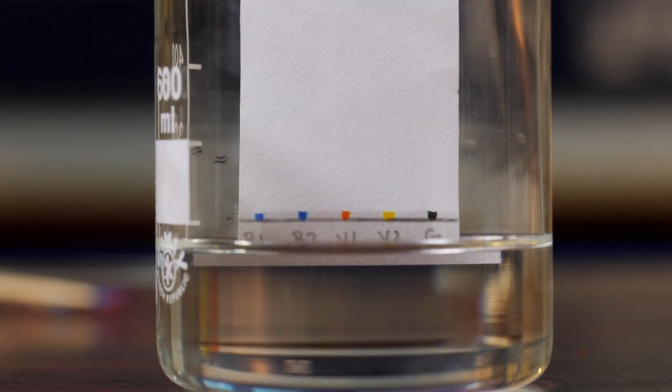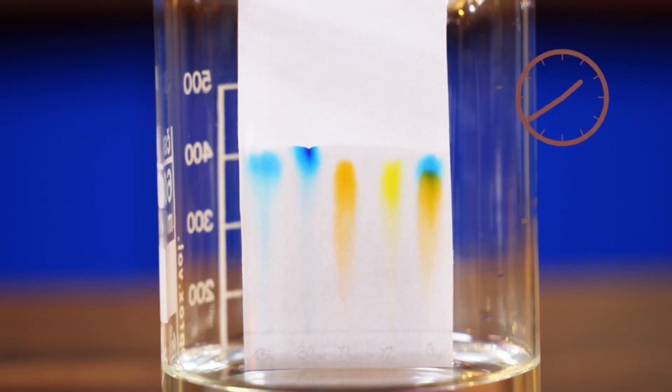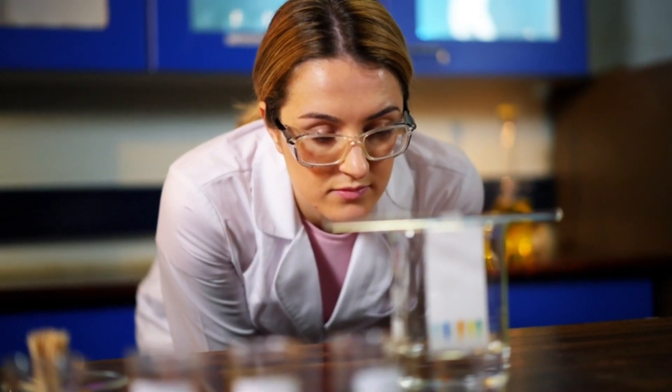You will notice that the paper absorbs the water and it rises up the chromatography paper past the spots of food coloring. When the water reaches the spots, the pigments will dissolve in the water and move up the paper.